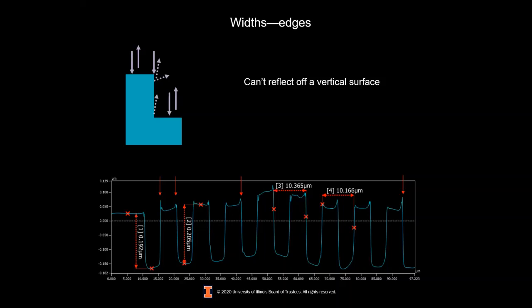So if they're 200 nanometers apart or further, because otherwise you might not be able to resolve the difference between the two of them and see that bottom part in between the two of them. But if they're far enough apart, yes, you can see them, but you'll end up with some weird edge effects. If you just want to know the height of them and they're wide enough that you can actually see the top surface of it, then yes, you can. Nano pillars are good. Nanowires, if they're a few nanometers, you won't be able to see just because of the resolution.